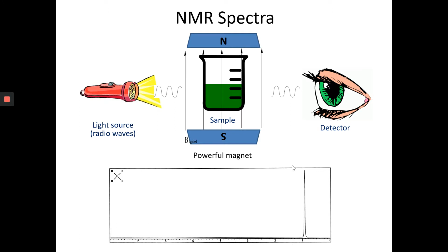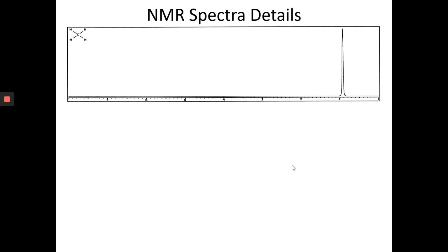So on to that. For all of these spectra, if you want, you can get out some of your packets and have a look at those. We're going to start with the packet that says NMR sample spectra. If you got a packet in the mail, it's the one with the blue cover. And also, why don't you grab out that yellow sheet that says sample proton NMR chemical shifts. It's just one page. So get out your blue NMR sample spectra and your yellow sample NMR chemical shifts. I'll hold on for a second, just hit pause, and then come back.